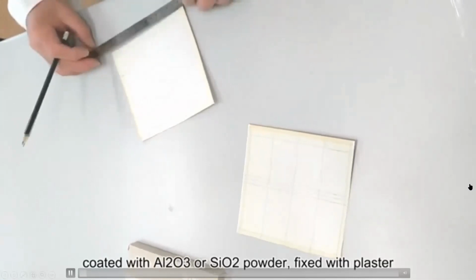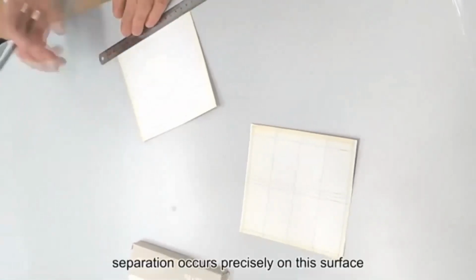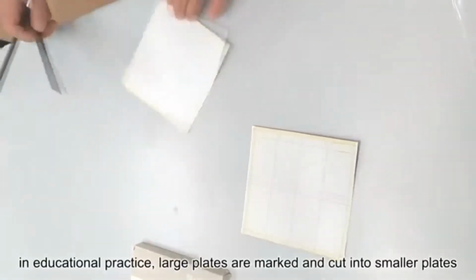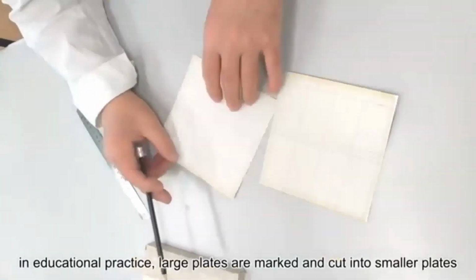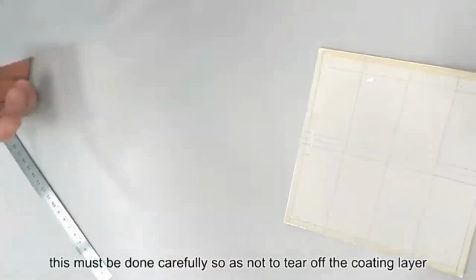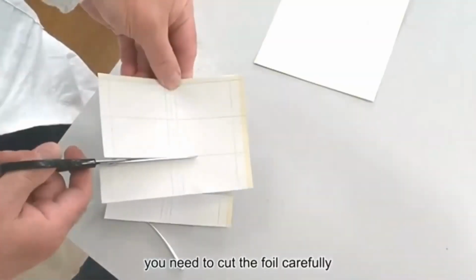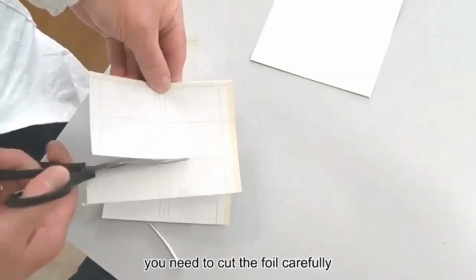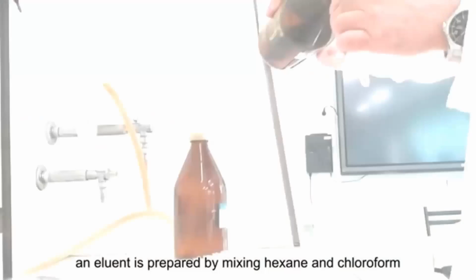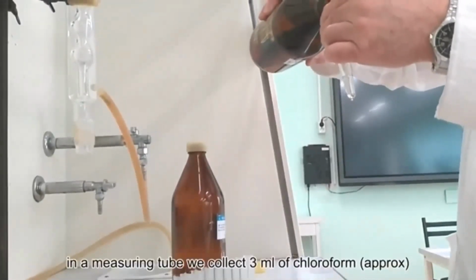Расчерчивать нужно очень аккуратно, мягким карандашиком. Просто вот так, едва касаясь, чтобы только было видно. Здесь есть такие желобки, видно, накатка должна быть параллельно длинной стороне пластины. К одному сначала попытаемся наносить 3 на 3 хотя бы.